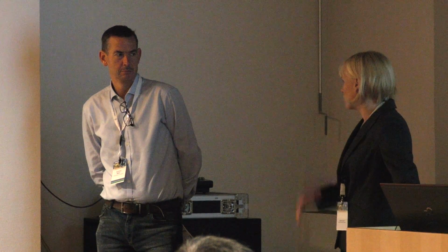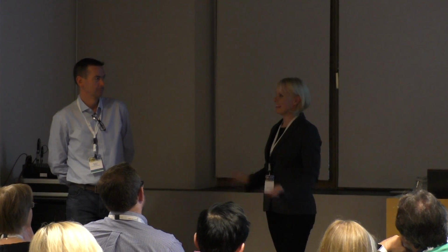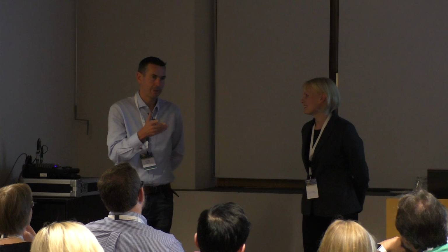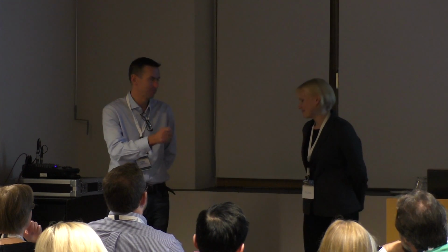And you mentioned the empty particles that are a factor. Is there a general rule about what regulators will accept? For AAV and whatever? There is. I cannot say about AAV and Lenti. I know what our ratio is. We keep empty particles for adeno below 10, but we also need to show the regulatory people that this is good, and then they accept or don't accept. Different transgenes that are maybe toxic to the helper cells are going to be much lower, but that's still acceptable. You have to go to them with: this is the best way to do it.